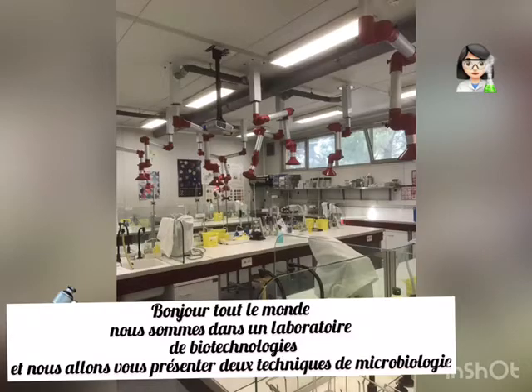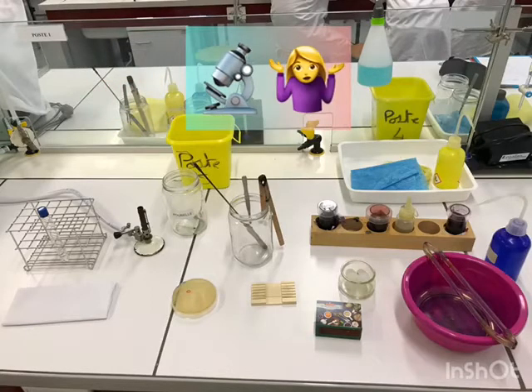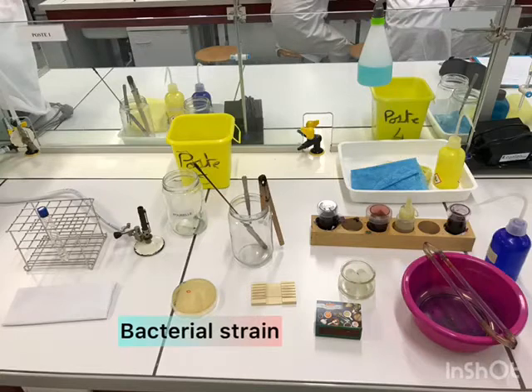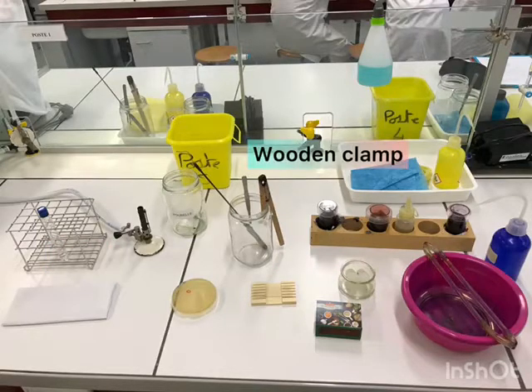First, we prepare our workspace. You will need: a loop wire, a Bunsen burner, physiological water, matches, a biohazard trash container, a microscope, dyes, alcohol, distilled water, a stopwatch, a bacteria strain, paper towel, a wire rack, a wooden clamp, and a glass slide.